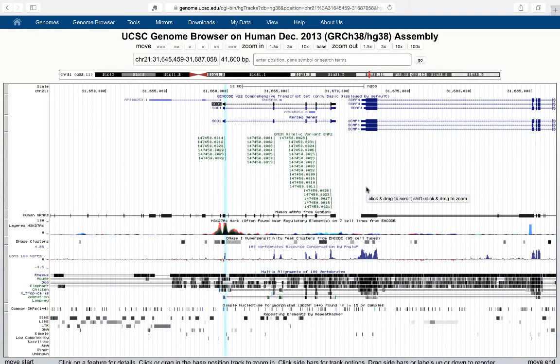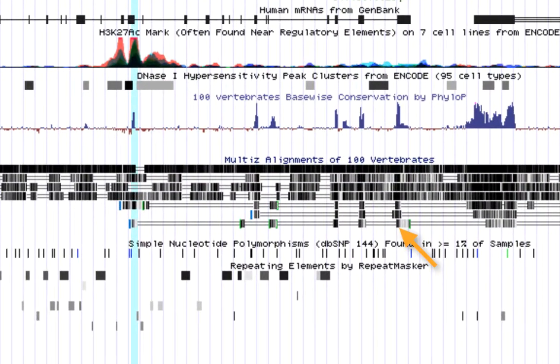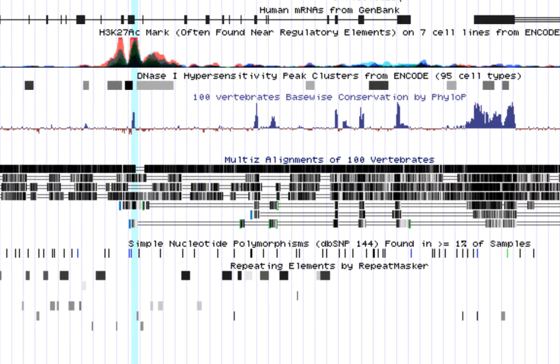Now you can see that even in highly unrelated species like zebrafish, the exons of the SOD1 gene are conserved. And of course in a species like rhesus monkey, which is much more closely related to us, both the exons and introns are conserved.